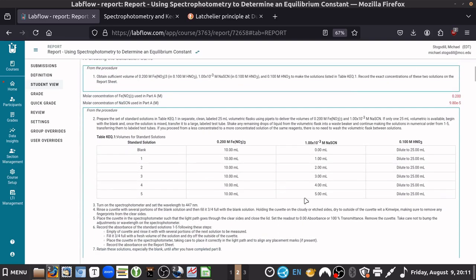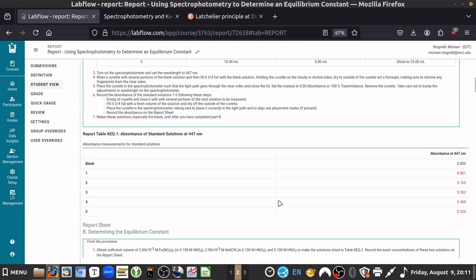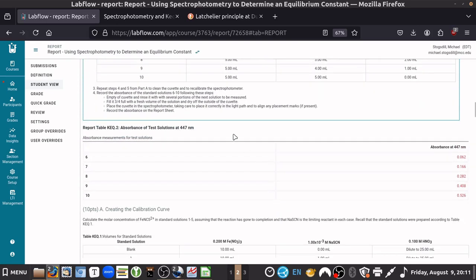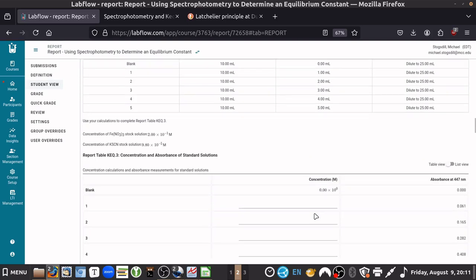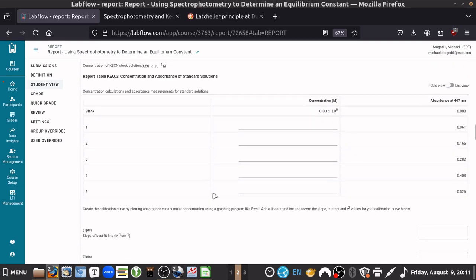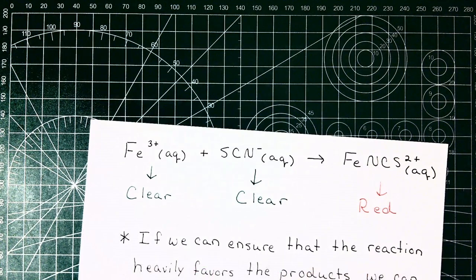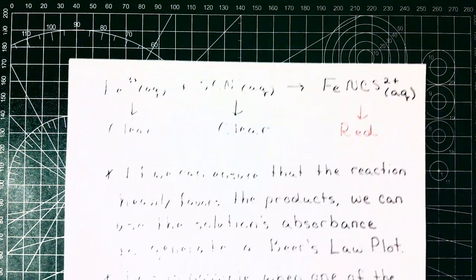You start this one off by requesting some virtual data. They show you where they filled that in, and then they start asking you to fill out this table KEQ3 with the concentration and absorbance of standards. It's a little unclear what exactly they're talking about, especially because they just put 'concentration in molarity' — they don't tell you the concentration of what.